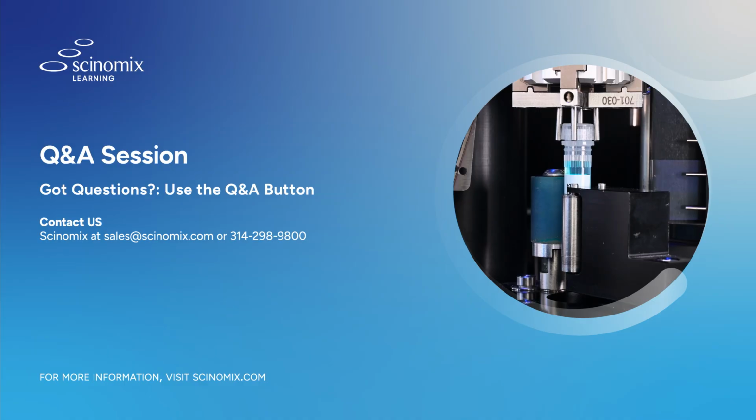Okay. This one's from Jennifer. Is this a system that would best match our business need of aliquoting one bulk into 6,000 vials? Right now, we do this by hand, and it takes 3 hours with a team of people. How long would the simple process of one bulk 2 liter into 6,000 vials take? Yeah, so it really depends. You saw the single channel pipette working, right? So this is going to be dependent on what type of liquids you're using.